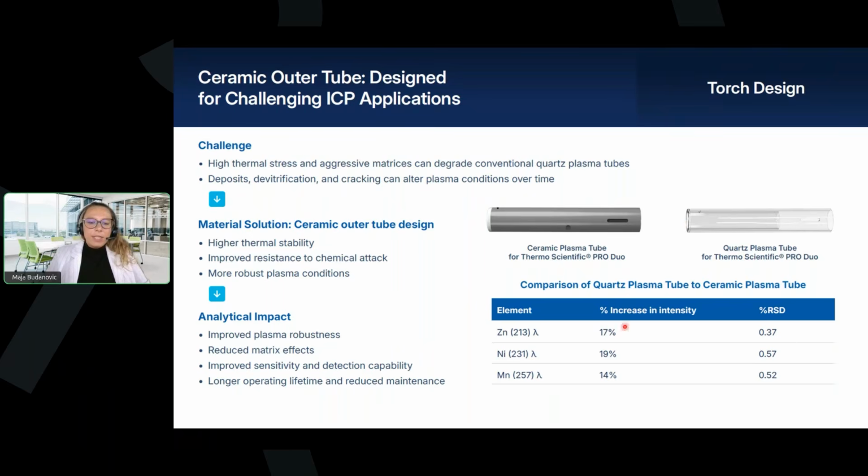And in this table, in the comparison between the standard quartz tube set and the ceramic outer tube set, we can see that the ceramic configuration shows increased sensitivities. And here we have the example of some of the elements such as zinc, nickel, and manganese.